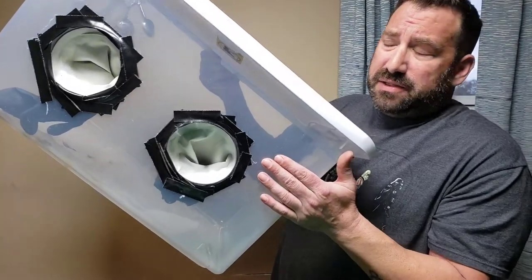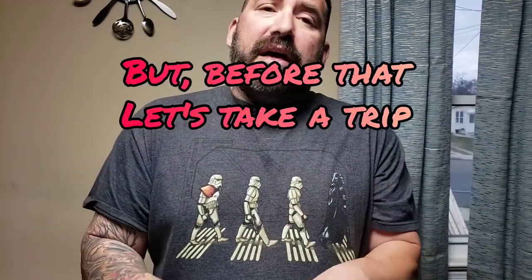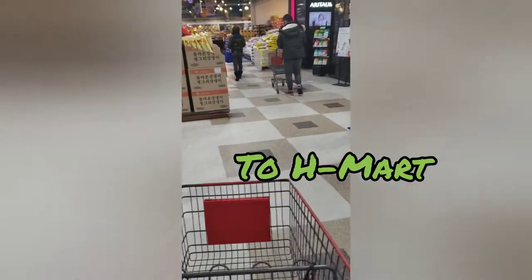Normally I would do this inside my still air box, but you guys aren't going to be able to see anything if I do that. So what I'm going to do is a couple of them without the still air box to show you guys, and then I'll do the rest inside the still air box.